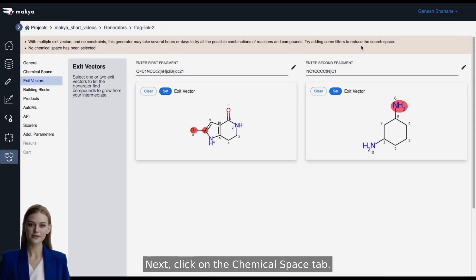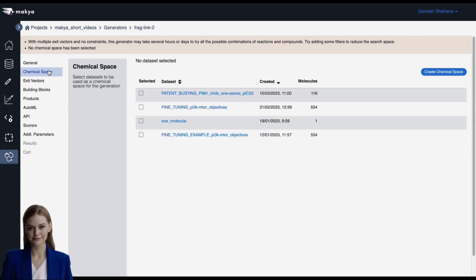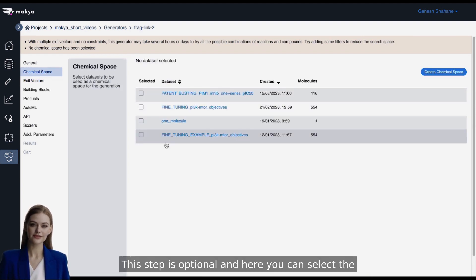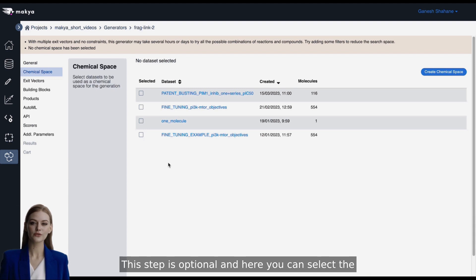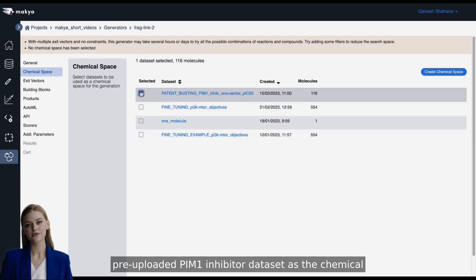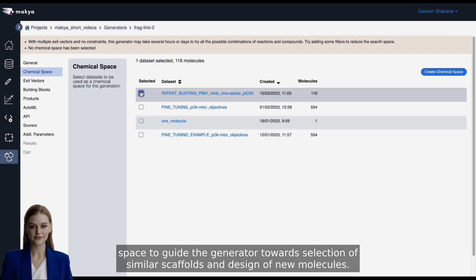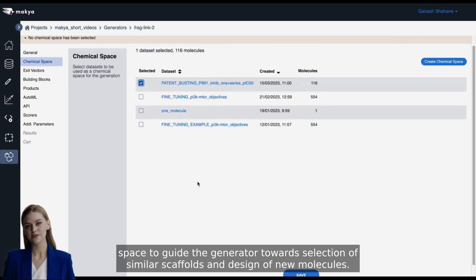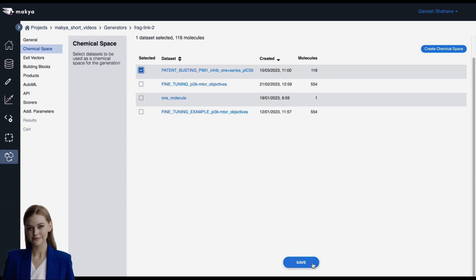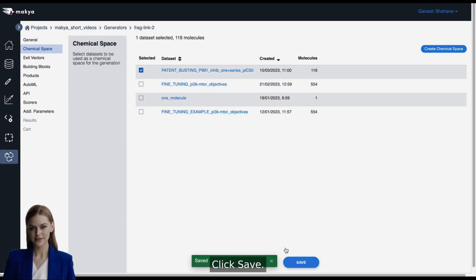Next, click on the Chemical Space tab. This step is optional and here you can select the pre-uploaded PIM-1 inhibitor dataset as the chemical space, to guide the generator towards selection of similar scaffolds and design of new molecules. Click Save.